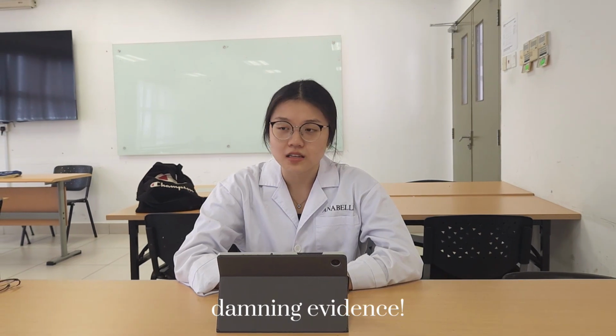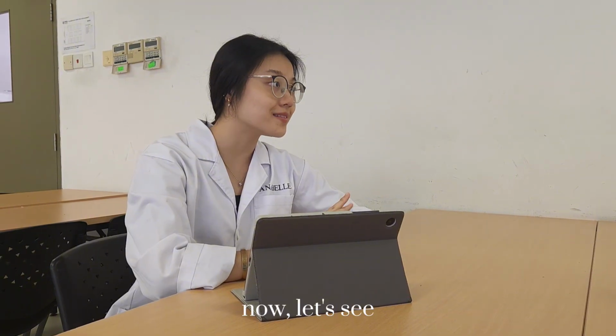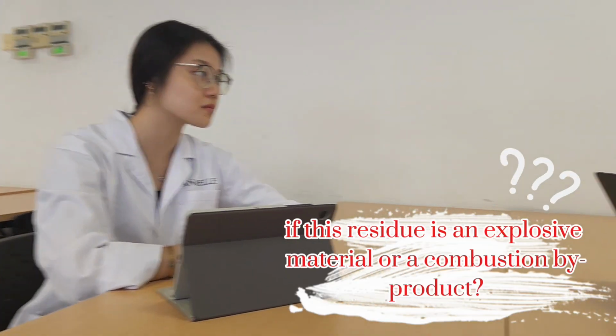Damning evidence. Jacqueline, what about the wall residue? Prepped and ready for FTIR. Now, let's see if this residue is an explosive material or a combustion byproduct.